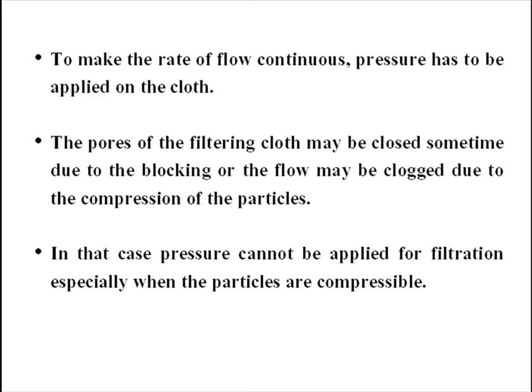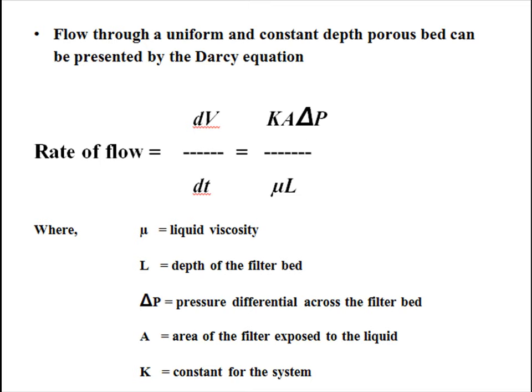The pores of the filtering cloth may sometimes be closed due to blocking, or the flow may be clogged due to the compression of the particles. In that case, pressure cannot be applied for filtration, especially when the particles are compressible.